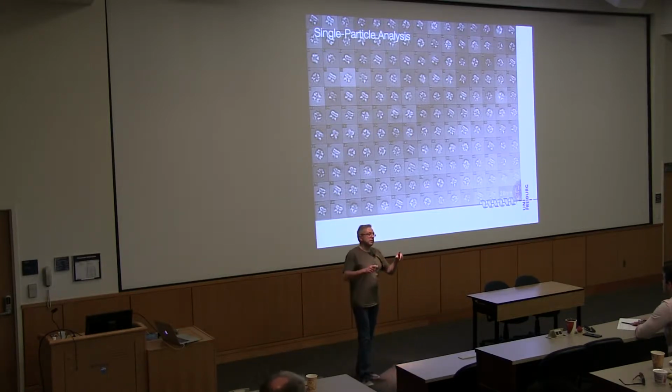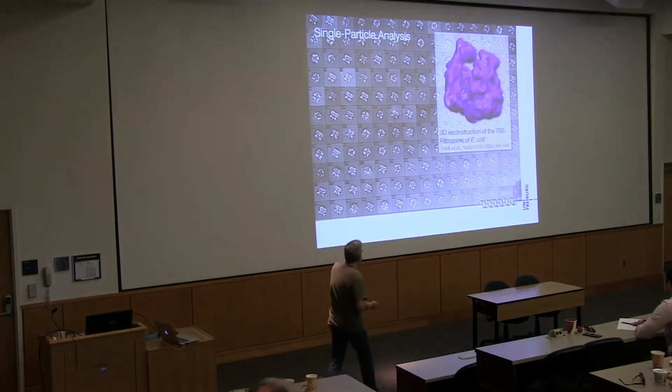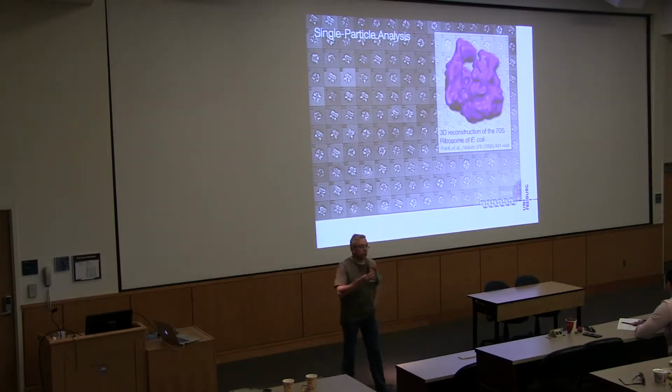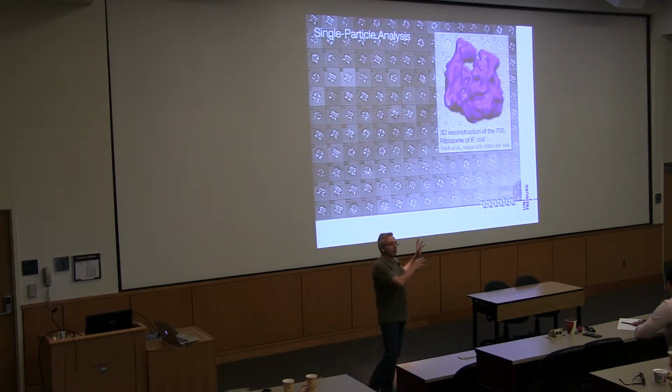Okay? And you do this 10,000, 100,000 times, and then it was actually Joachim Frank, I get to him in a moment, who then in 95 published this reconstruction of the ribosome, large subunit, small subunit, which is a single particle reconstruction generated by methods like these. Okay? And that is where crystallographers, modest as we are, termed the coin like blobology. And we're getting that back now.